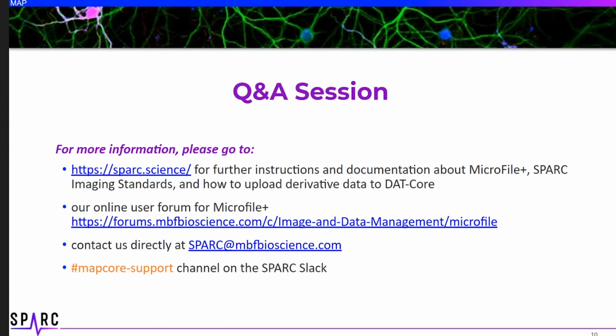All right, Nate, is there a size limit to the files that can be converted, Dr. Oconnor? Hey, everyone. I would say to that, no. We regularly work with images from whole slide image scans that are in the hundreds of thousands by hundreds of thousands range by thousands of planes. Practically, we haven't tested that, but we haven't encountered a limit.